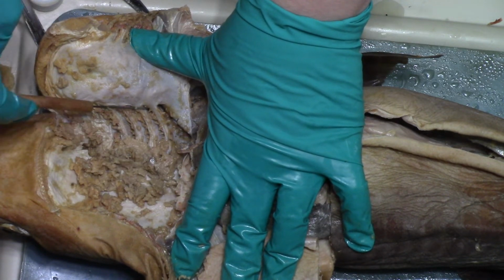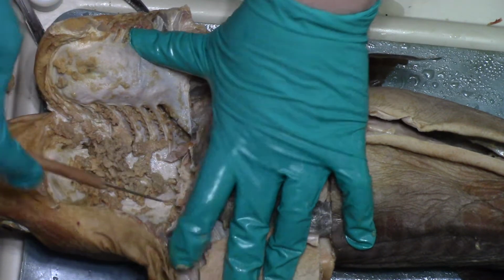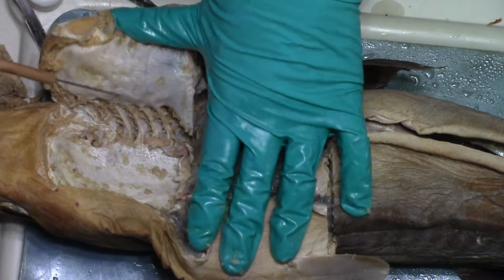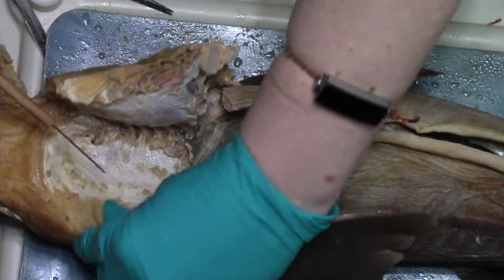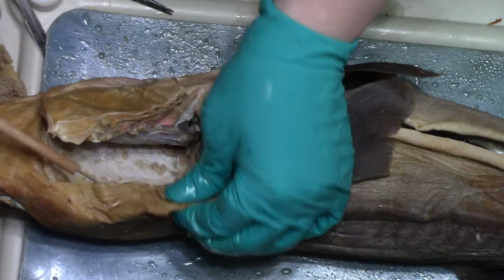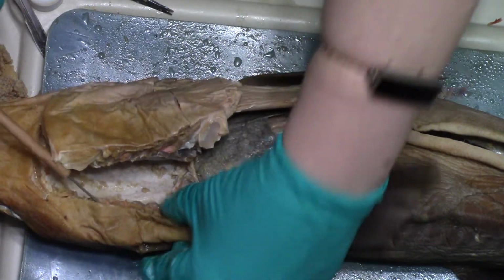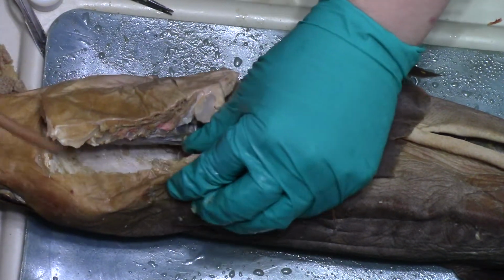I wonder if this is all food out of his stomach or clotted blood. Let's just move it all out of the way. So these are the gill slits, and you can see them on this side too, and they go through into here. Sometimes, depending on the size of the shark, you can actually stick your finger through them. But I can definitely stick the probe through them.